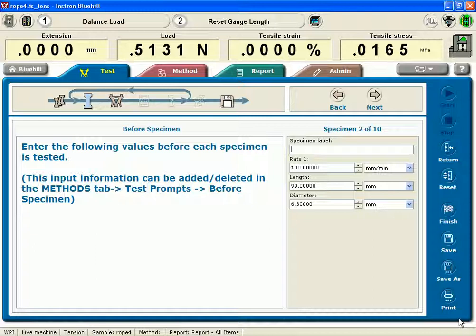Hello, this is Chris Billier at WPI with a tutorial on running pre-cycling on a Blue Hill 2 with an Instron 5544 mechanical testing machine, which is screw-driven. My pre-cycling is going to be load controlled at a fairly high rate, showing that a screw-driven machine doesn't control very well doing that.